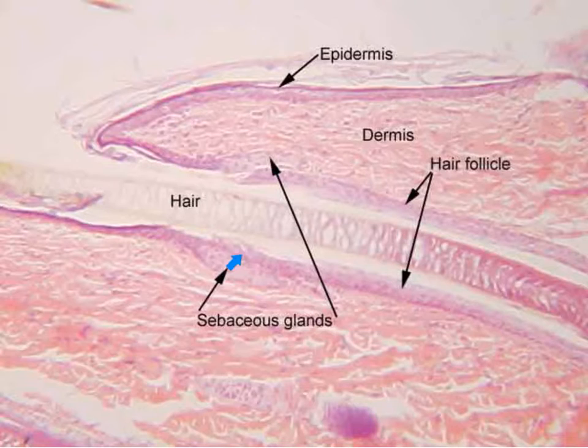The little oil glands that are attached to the hair follicle are the sebaceous glands. These are the oil glands. Without these, the hair would grow fungus and have other issues. It would dry and break. We can see the epidermis right here and moving down into the dermis.